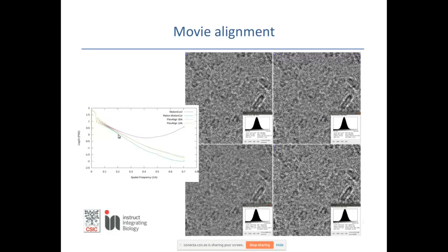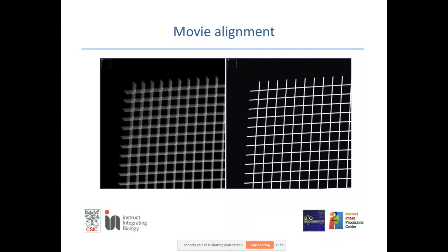So there is a bad custom all of us do, that is just using one program for the movie alignment, and we are happy with its results. We don't check anymore what it gave. But actually, there is a lot of detail there. And this is another example.